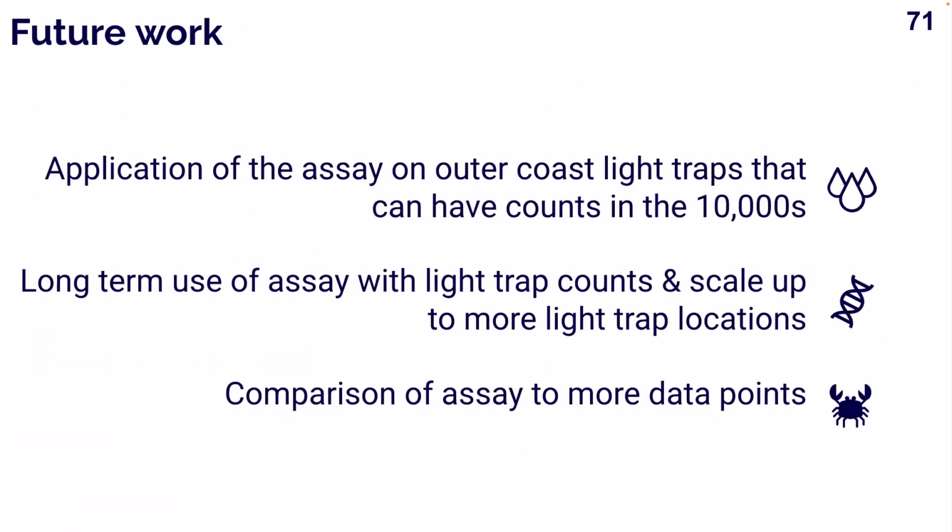because they can have counts into the 10,000s, have long-term use of this assay with light trap count, and possibly scale up to more light trap locations, and also comparison of this assay to more data points, so having more light trap collections and water samples to compare against.